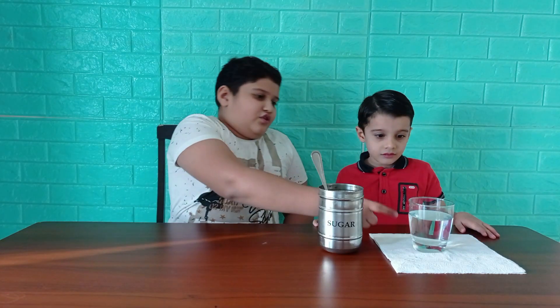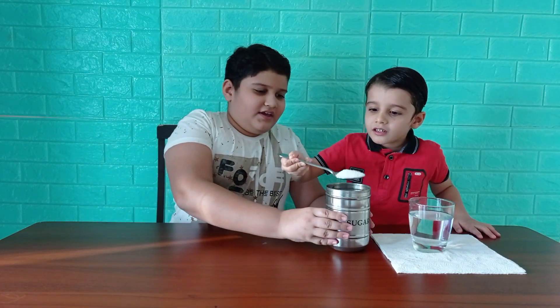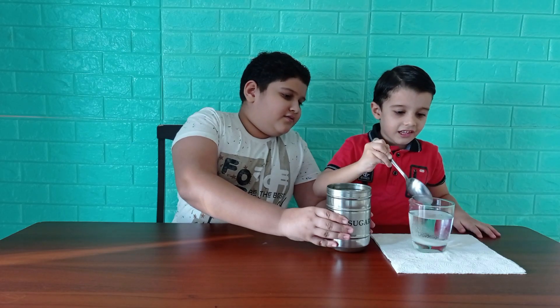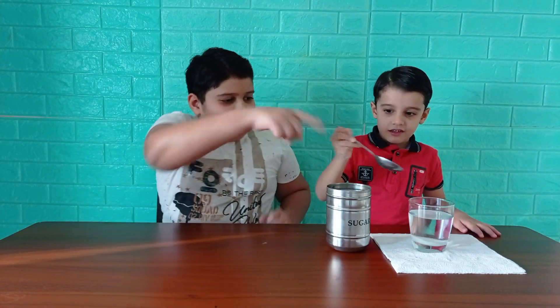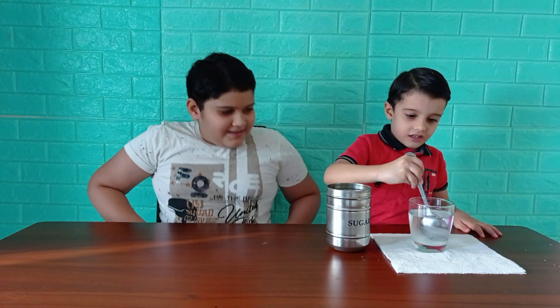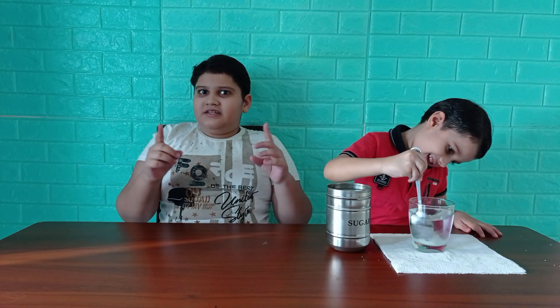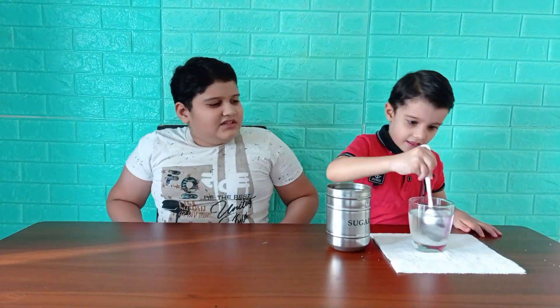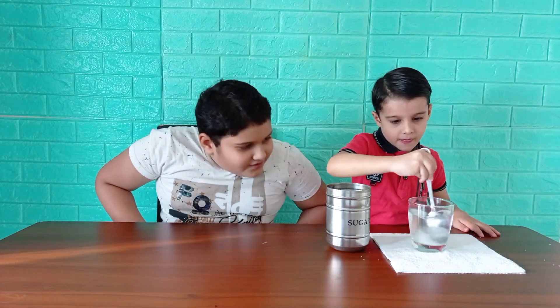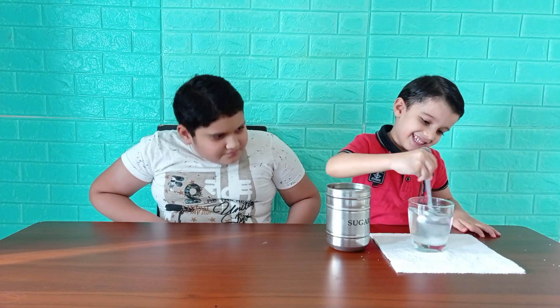Right now we are going to make a solution. Arjun, can you please mix the solute sugar with the solvent water? Mix it — and after a while you will see that you won't be able to see the sugar anymore.